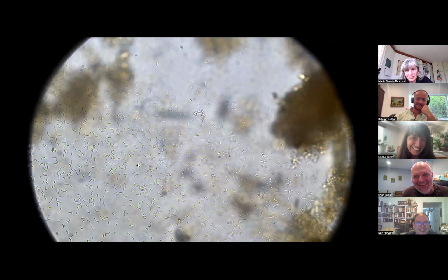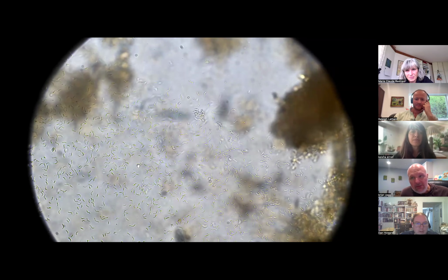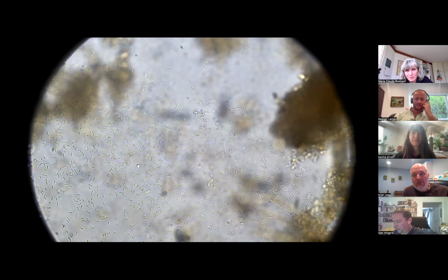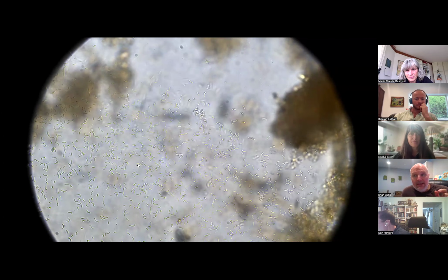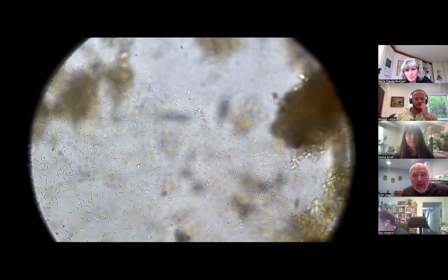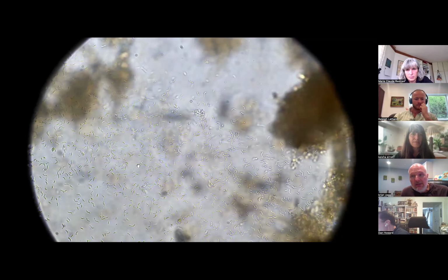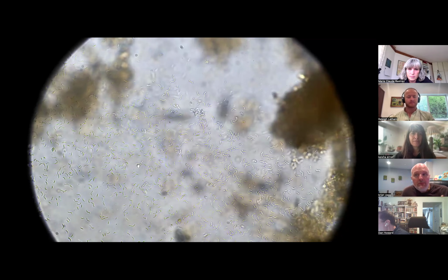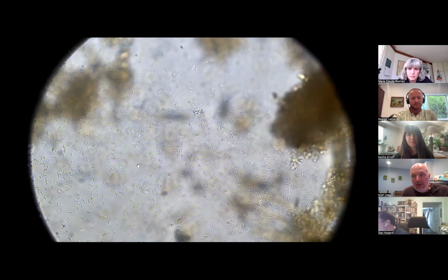The crazy thing about this is it's from the same vermicompost. You haven't seen my vermicompost sample yet, but this is coming from the same vermicompost. When I pull it from the worm bin, I hadn't seen any spirilla at all, which means it's there, just dormant. But when it went anaerobic, it was the right conditions for them to completely thrive and reproduce. It's a good example that even though you can go through the whole process of making really good aerobic material, the anaerobes are going to be there. They're just in a dormancy state, waiting for their time and saying, oh, it's now my time.